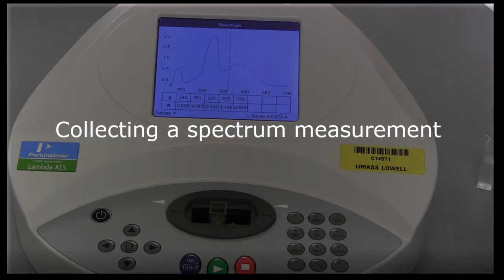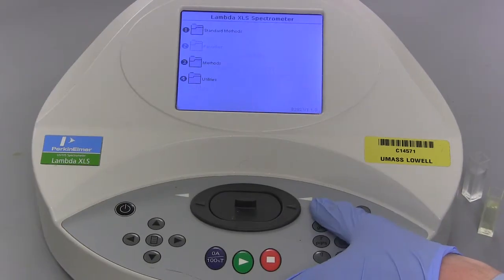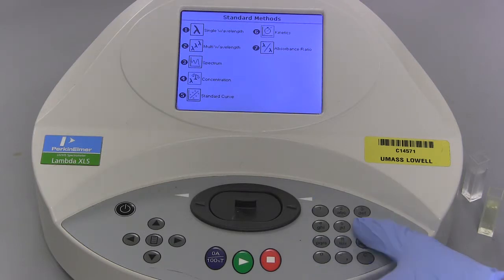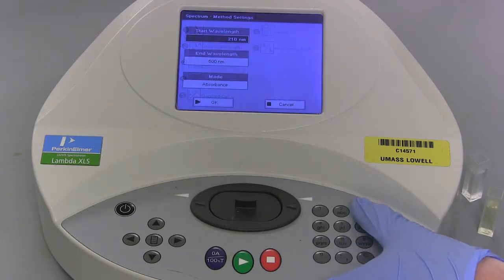This portion of the video will show how to collect a spectrum from your sample. To calibrate, press 1 on the spectrometer screen for the Standard Methods folder. In the Standard Methods folder, press 3 to open the Spectrum Methods settings.